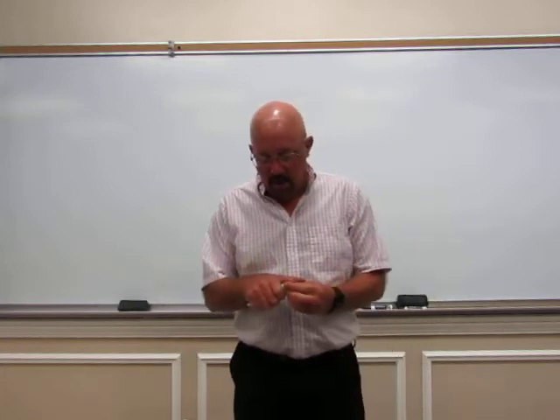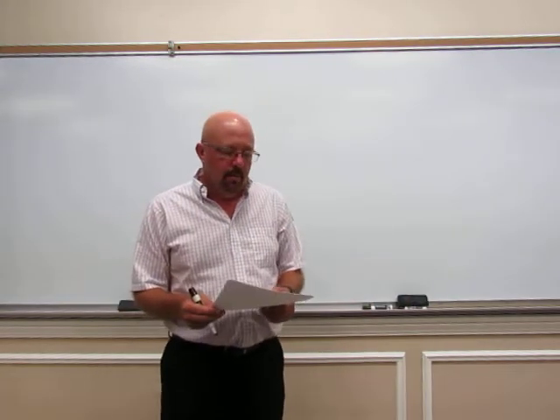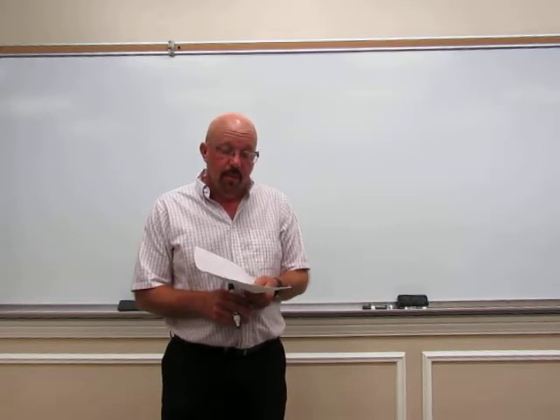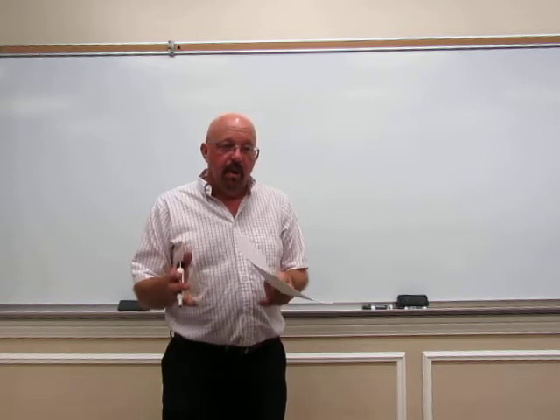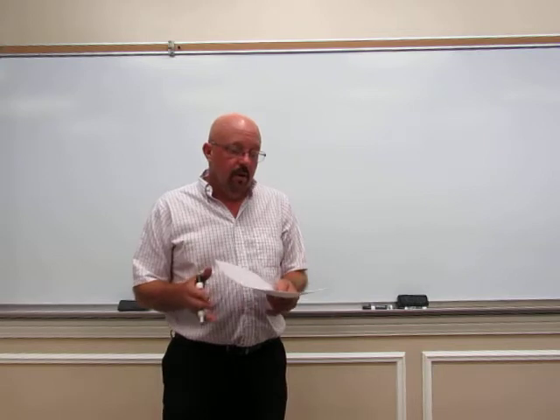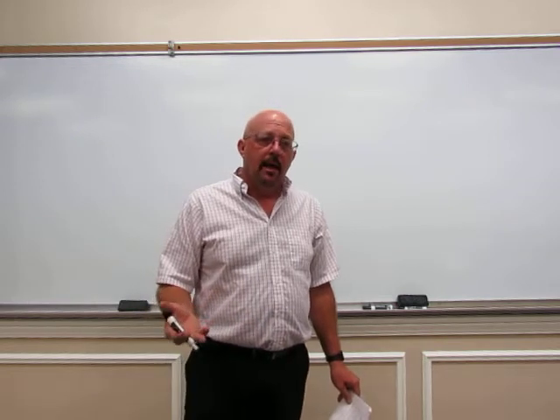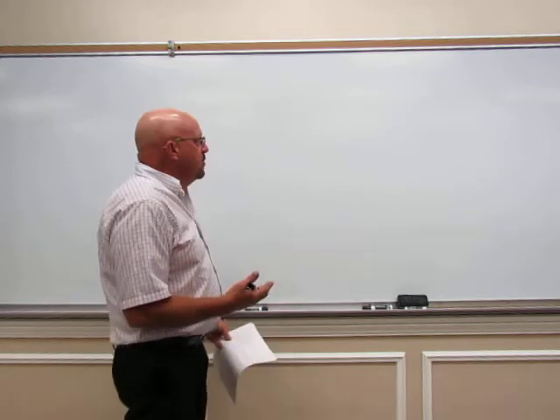Okay, this week in lab we are doing an extraction experiment. So let's talk a little bit about the theory of extraction. Extraction is a general term for the recovery of a substance from a mixture by bringing it in contact with a solvent that preferentially dissolves the desired material. Now, our initial mixture can be a solid or a liquid. So therefore we have two types of extraction.